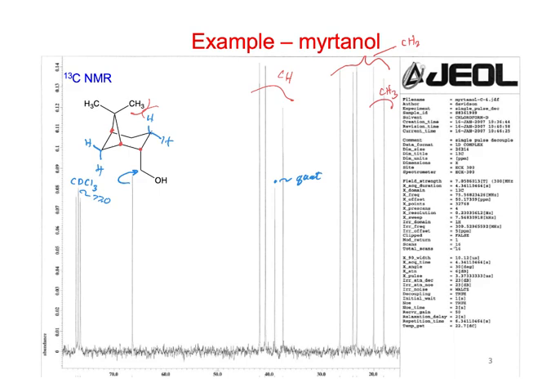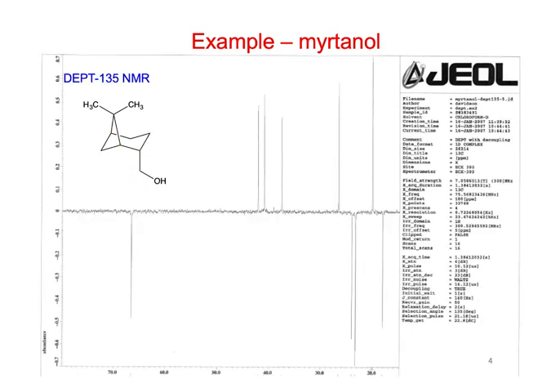So how would we tell CH3s versus CH2s? A DEPT might be a good thing to do. Okay, so we were right. Here's the CH2 for that one.